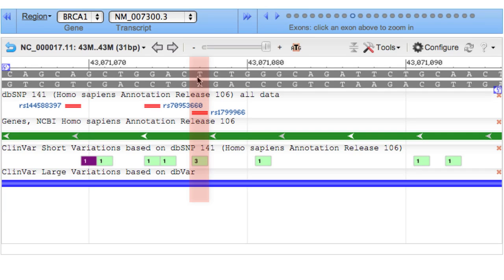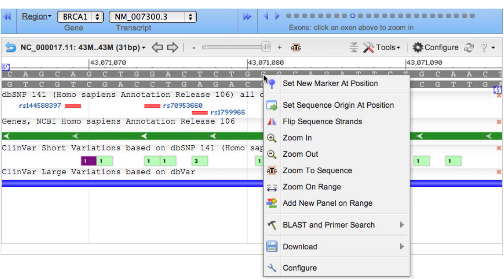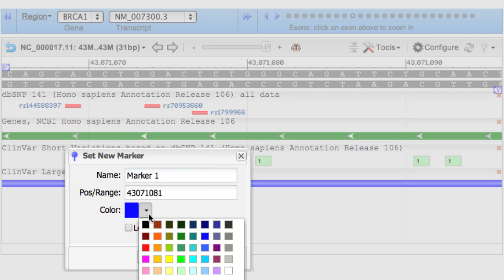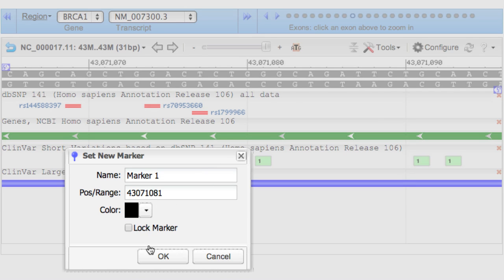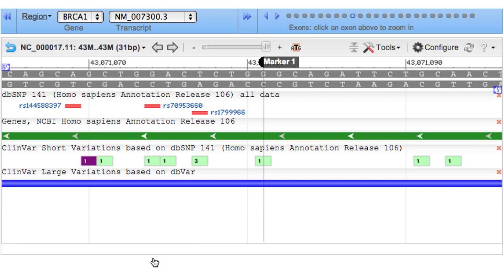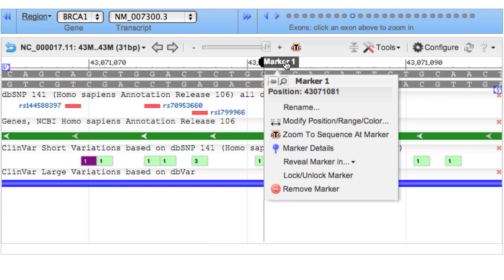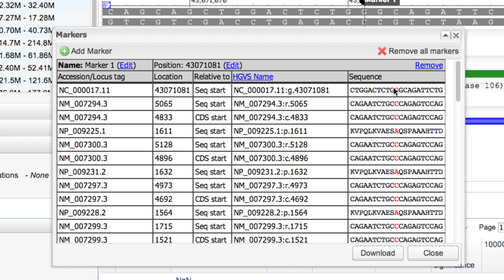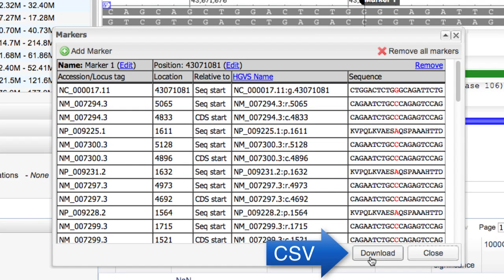Of course, I can do this for a known SNP, but also for any position. I'll right-click on this G, set a new marker, change the name and color if I like, then mouse over the marker and select Marker Details. You can also download this table for import into a spreadsheet.